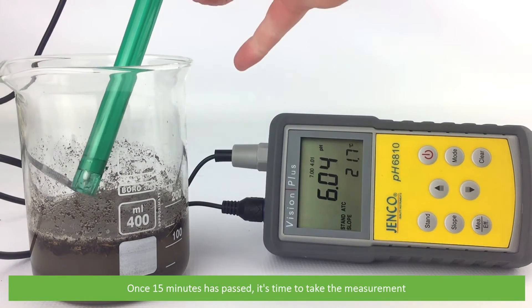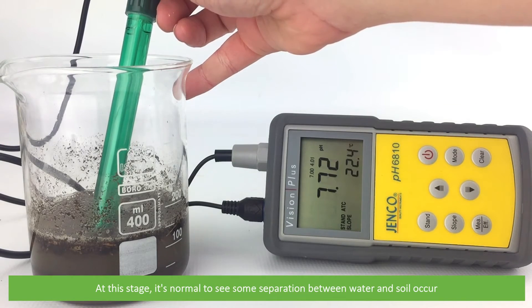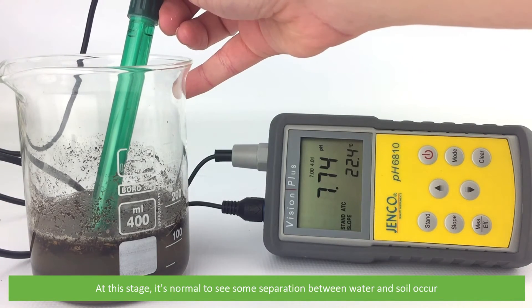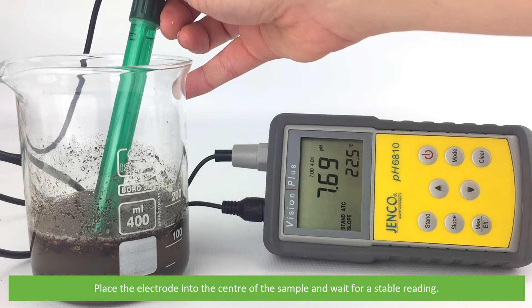Once 15 minutes has passed, it's time to take the measurement. At this stage it's normal to see some separation between the water and the soil occur. Place the electrode into the centre of the sample and wait for a stable reading.